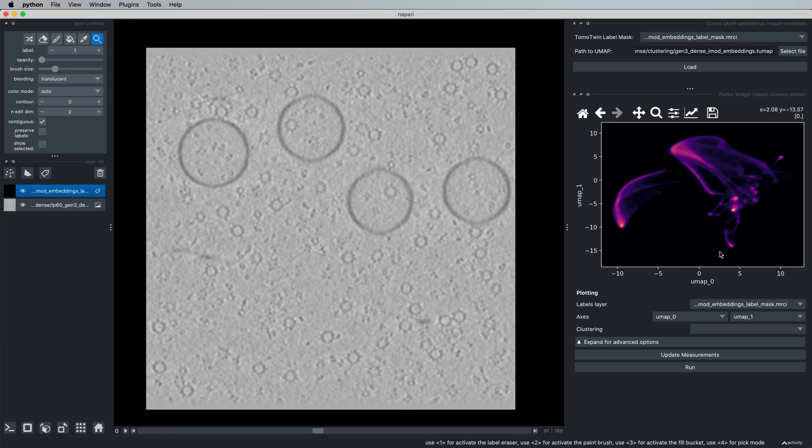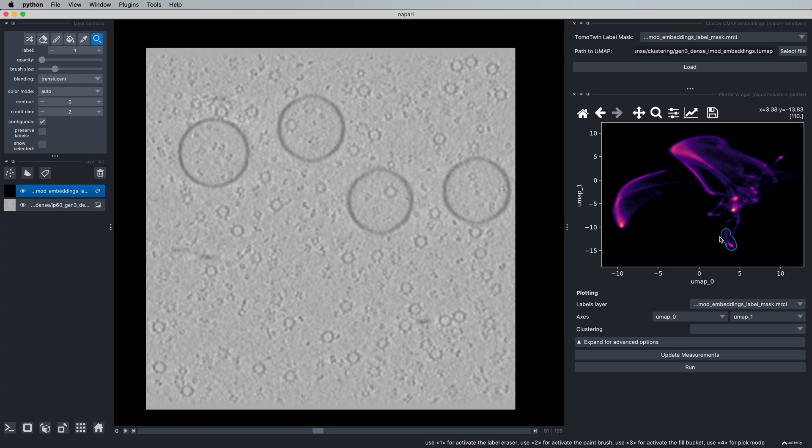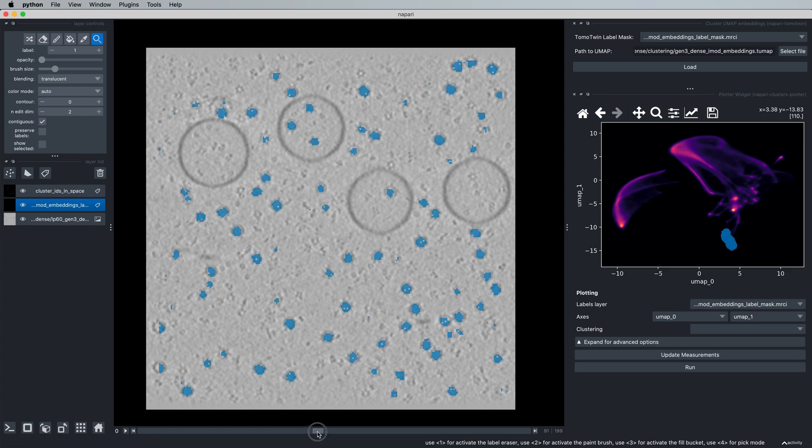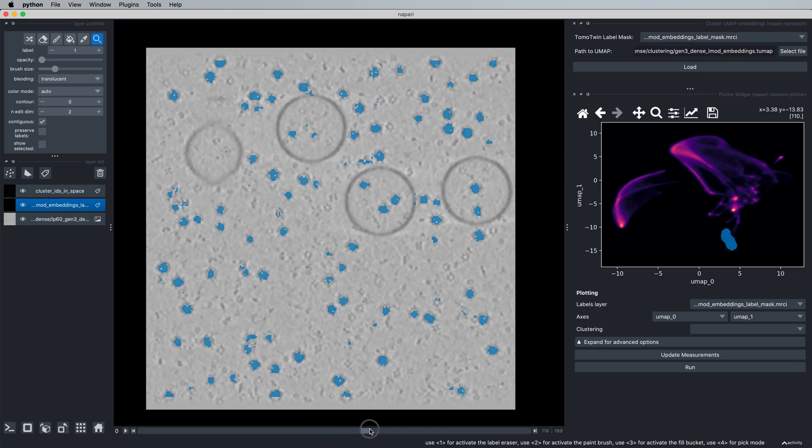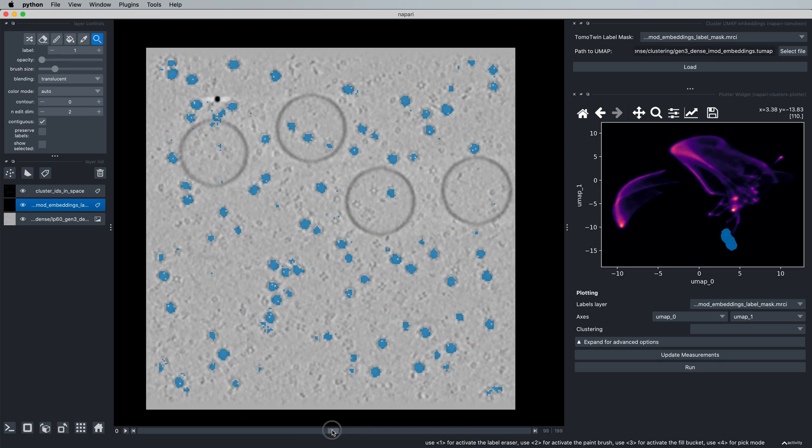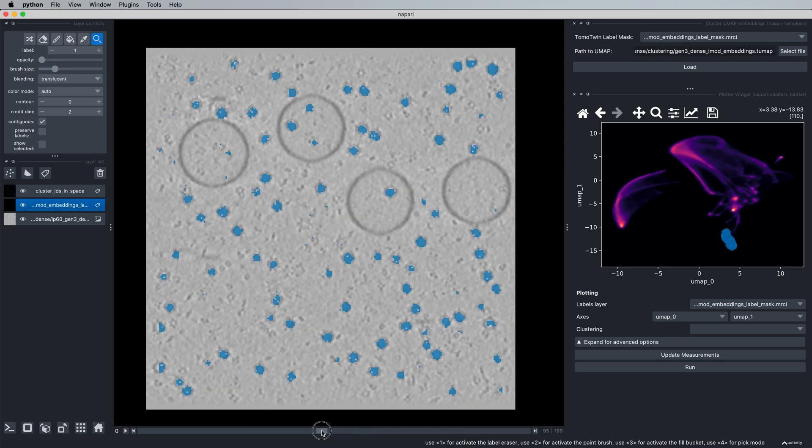Now, the basic usage of this tool is to simply outline a cluster of interest in the UMAP, give it a few seconds to calculate, and see these embeddings now highlighted in the tomogram. In this case, picking this particular protein.